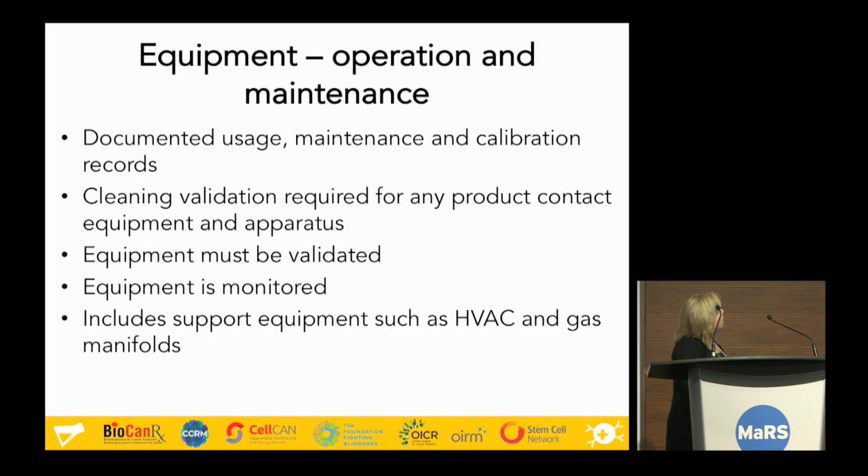The equipment has to be monitored, and the equipment also includes things like HVAC, so your air handling systems, and any gas manifolds that you have with gases going to your incubators.